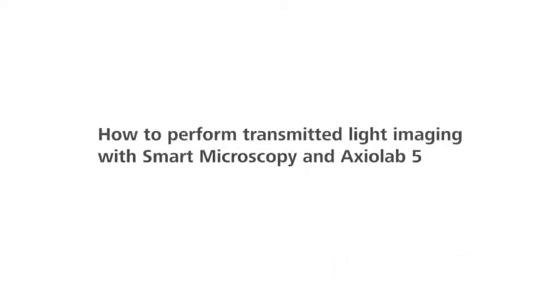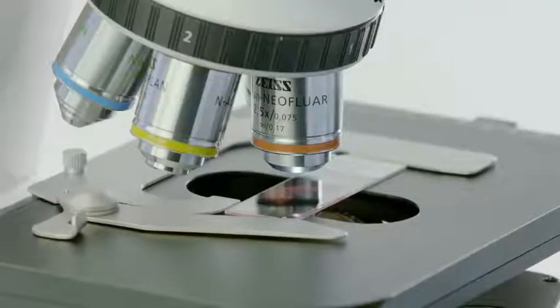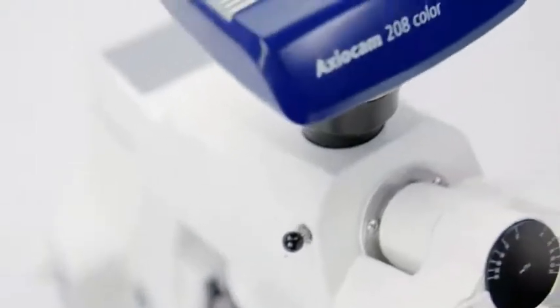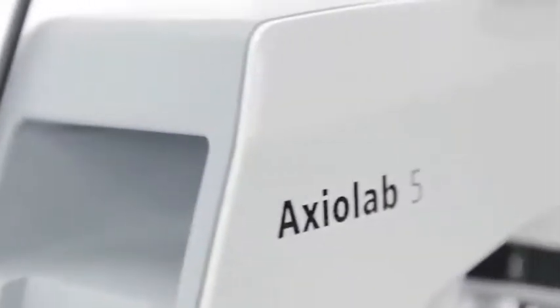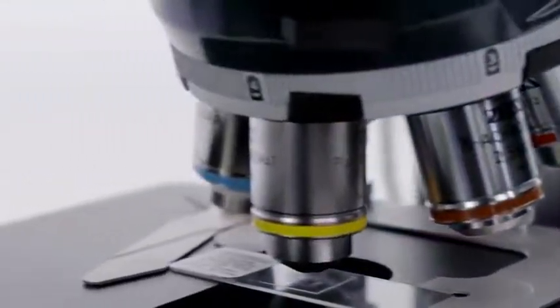How to perform transmitted light imaging with Smart Microscopy and Axiolab 5. Imagine acquiring images in transmitted light as you see it through the eyepieces, complete with the right scaling, using just your microscope, without a PC. With Smart Microscopy and Axiolab 5 from Zeiss, you can do it all in one go. Here's how it works.